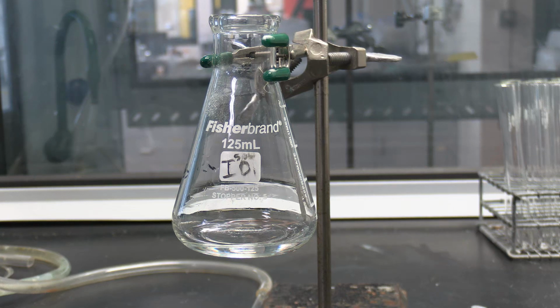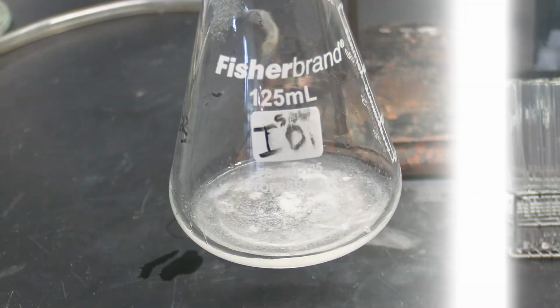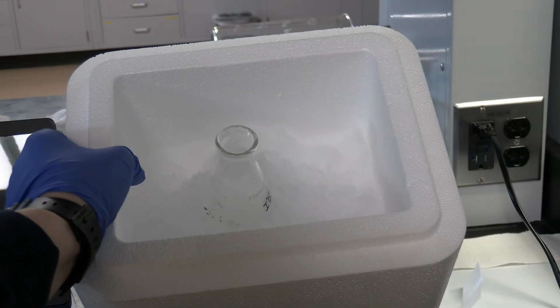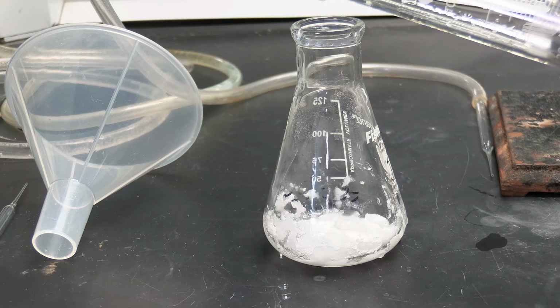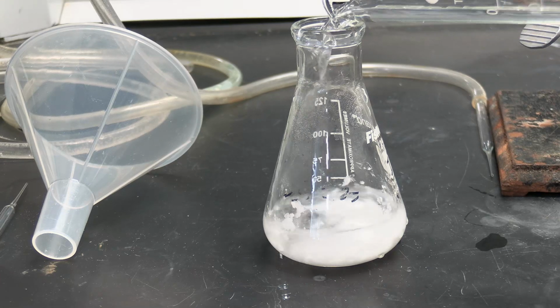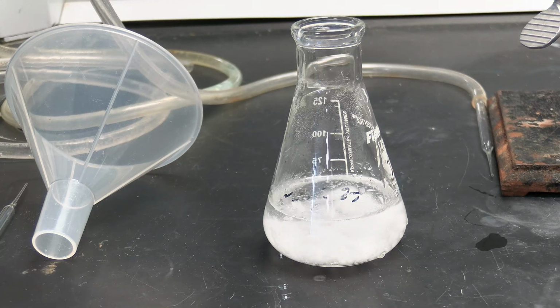After the 10 minutes is up, I leave the flask to cool to room temperature and the acetylsalicylic acid begins to crystallize. Once at room temp, I leave this flask in an ice bath to continue to cool down and crystallize. My product is now formed into full crystals. To filter out any acetic acid, I add 50 milliliters of water and then leave the flask once more in an ice bath. I'm about to perform vacuum filtration to separate the solid from the water, and I'll explain how this works.